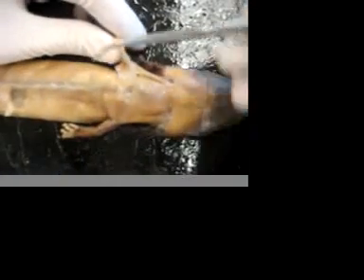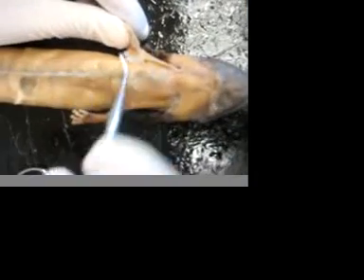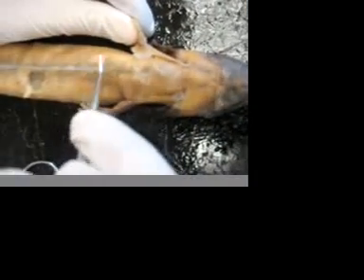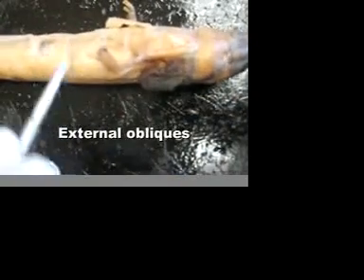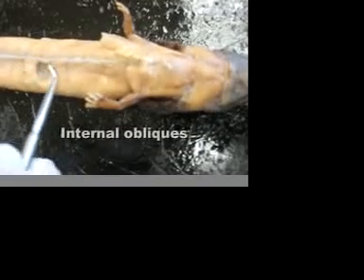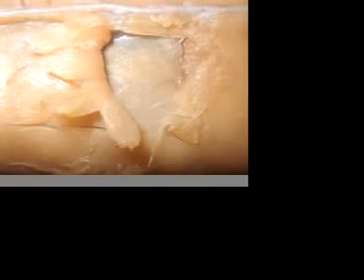Going down onto the belly, here we have the rectus abdominis. It goes all the way down the belly, and you can see it goes in a straight line. The external obliques go like this, and the internal obliques are right in there — you can see them better on the picture. And the linea alba is the dark line that's going down.